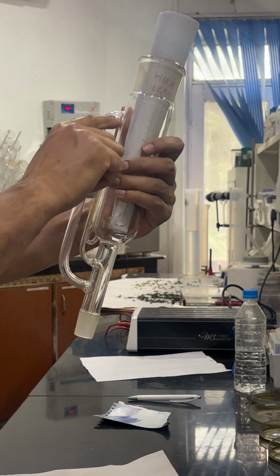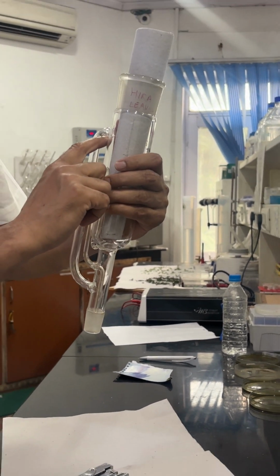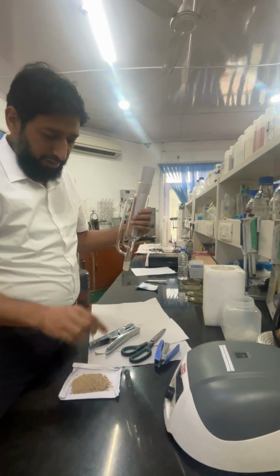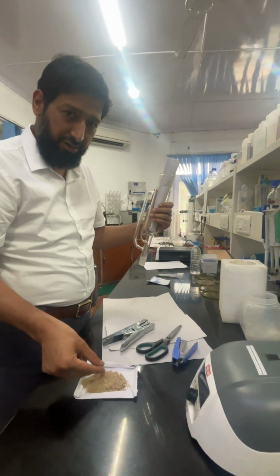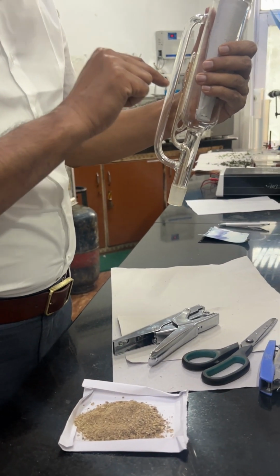We'll fill it below this level. Your material that is here, some plant extract you can see here. So this plant extract will be put in the thimble.